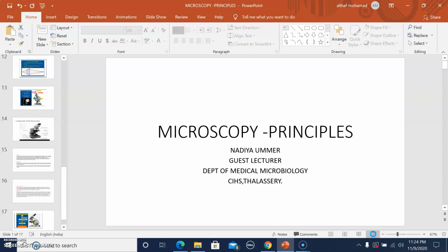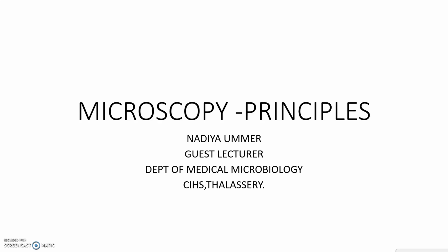Good afternoon all. So today in the methodology and instrumentation we have entered the new unit. We have completed the first unit, that is different types of equipments used in microbiology laboratory, and then we have entered into the second unit, which includes microscopy. So first we can deal with the principles which are involved in microscopy.